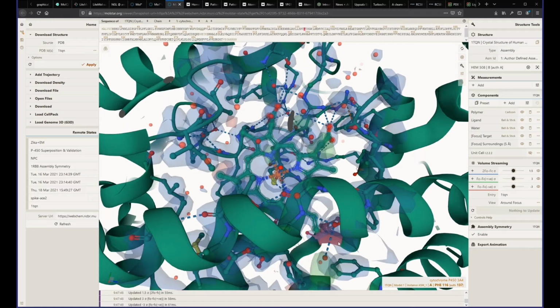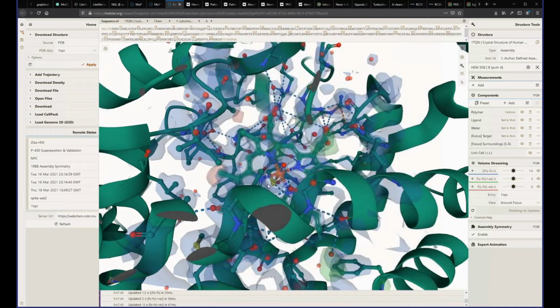What will be possible is, if somebody knows an interesting view of a protein, they will be able to go directly to the Protein Data Bank, create a view like this, add a few 3D labels and annotations, click save, and any new user that comes in will see a list of the annotations provided by the other users. So it will be kind of, well, Twitter for molecular states or something along these lines.